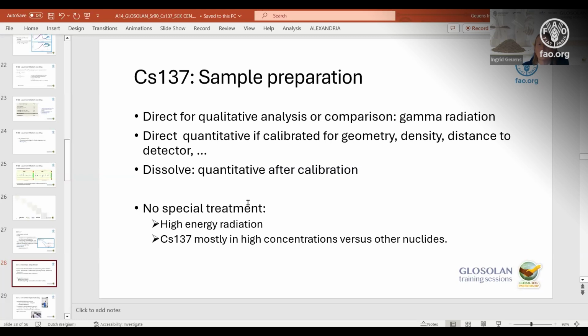That's why most of the time we still dissolve the samples, because for water samples, we've done a calibration. And as soon as you've done a calibration on your gamma spectrometer, you can measure all samples for a full year. So it makes it much easier. You don't have to calibrate every time again. That's why you can measure directly on the sample, but we still say if we have to go to very precise results, we do dissolve our materials.